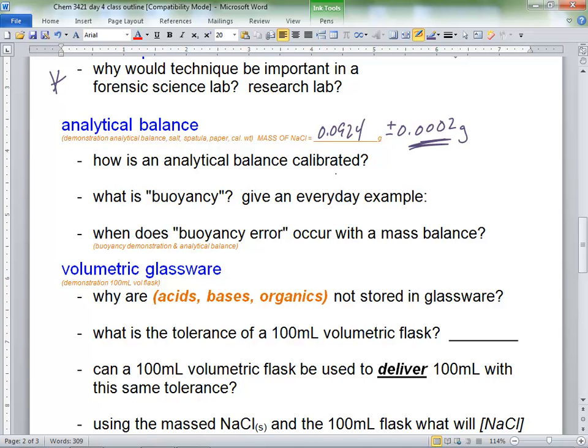Okay, you ready? 79.9890. Okay. What's the issue here? The issue here is it's kind of hard for you to go from the gas lighter to this, but the point is, in this activity, you have to measure a volume of gas. So you fill this guy up, stick it in a bag.